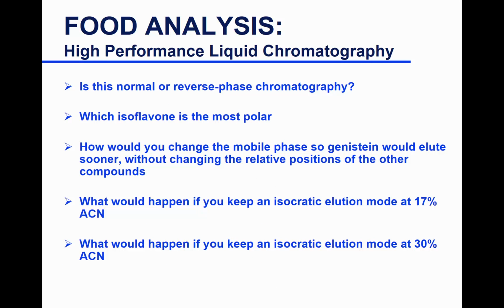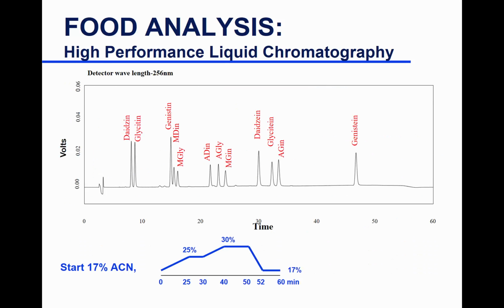Okay. Which isoflavone is most polar? So if it's a reverse phase, the interaction with the column would be based on nonpolar or polar interaction? Non-polar.